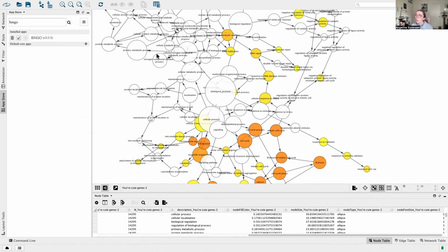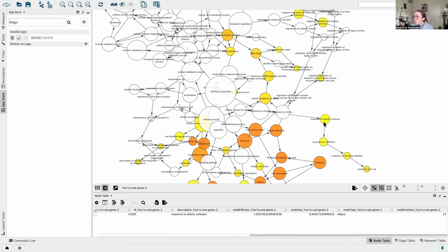Like if you turn something in like this where you can't really see any of the terms, that probably will not earn you favor for your grade. But if you are looking at this section, for example, these are all spaced out nice. It's not cluttered. It shows the progression of what you're looking at. So that would be a lot better. But feel free to manipulate these and move them how you want.